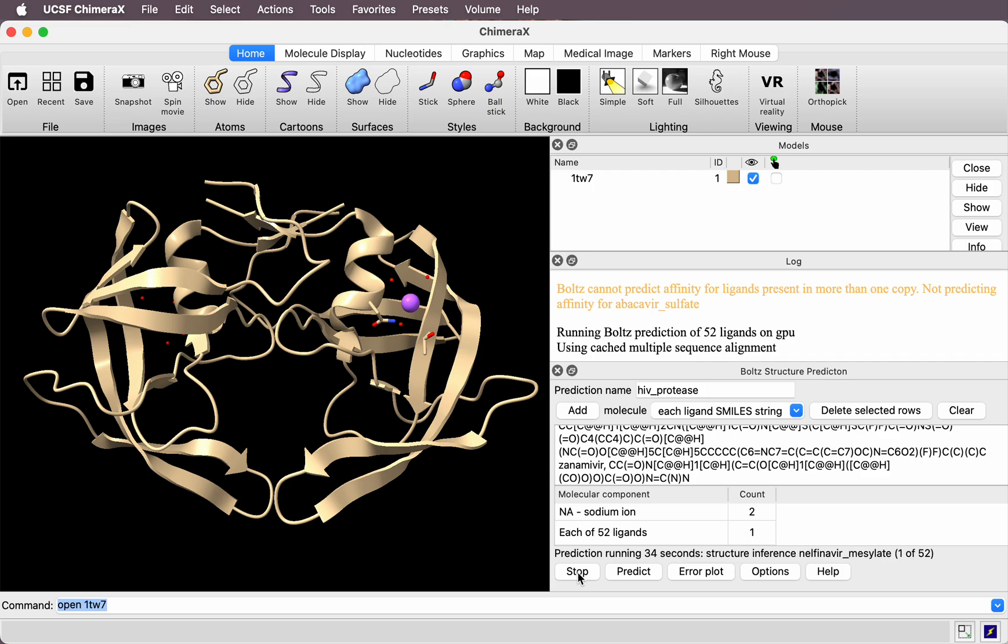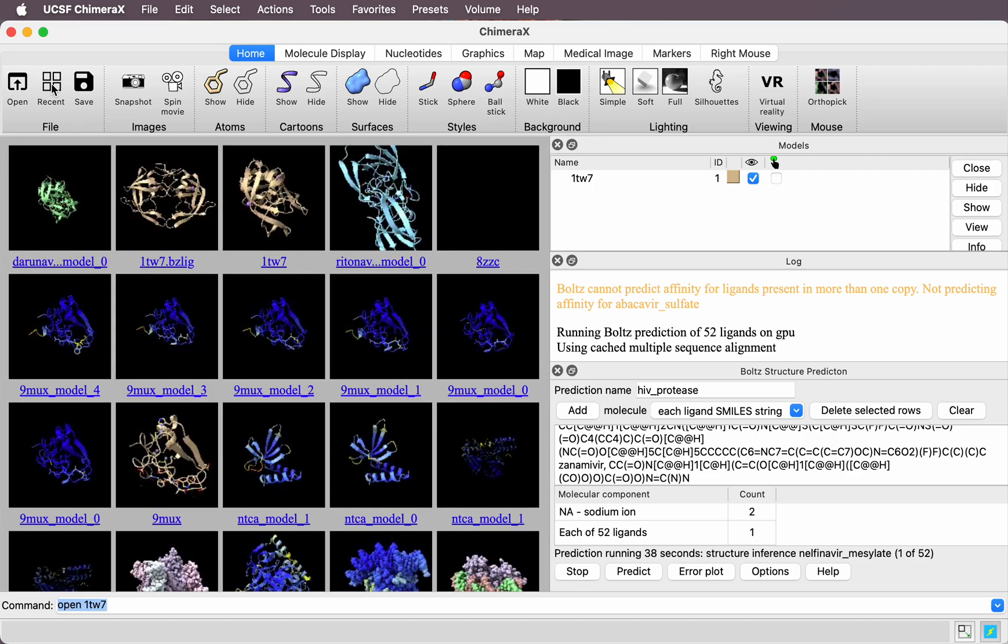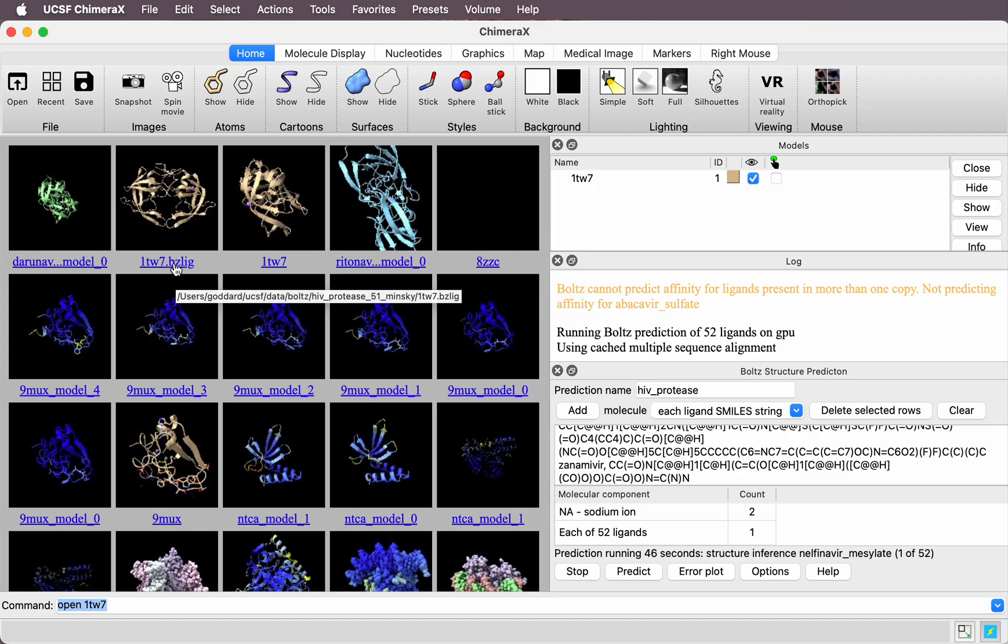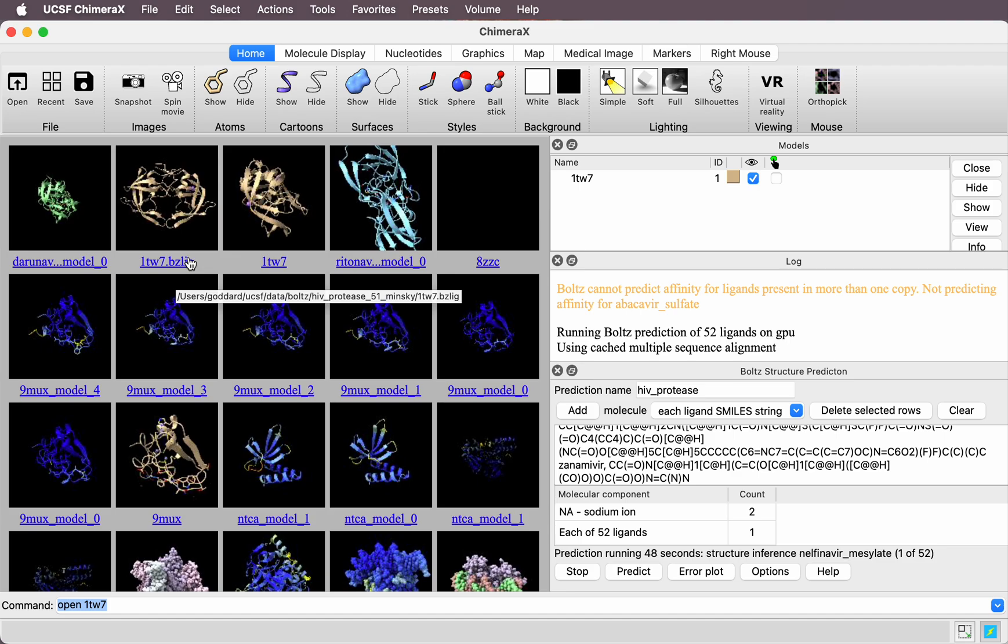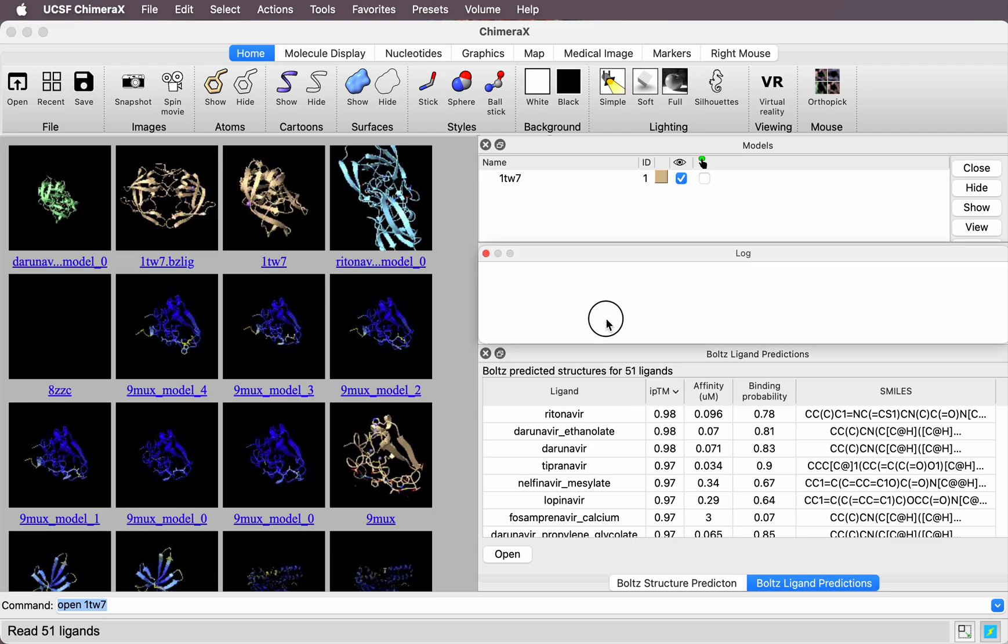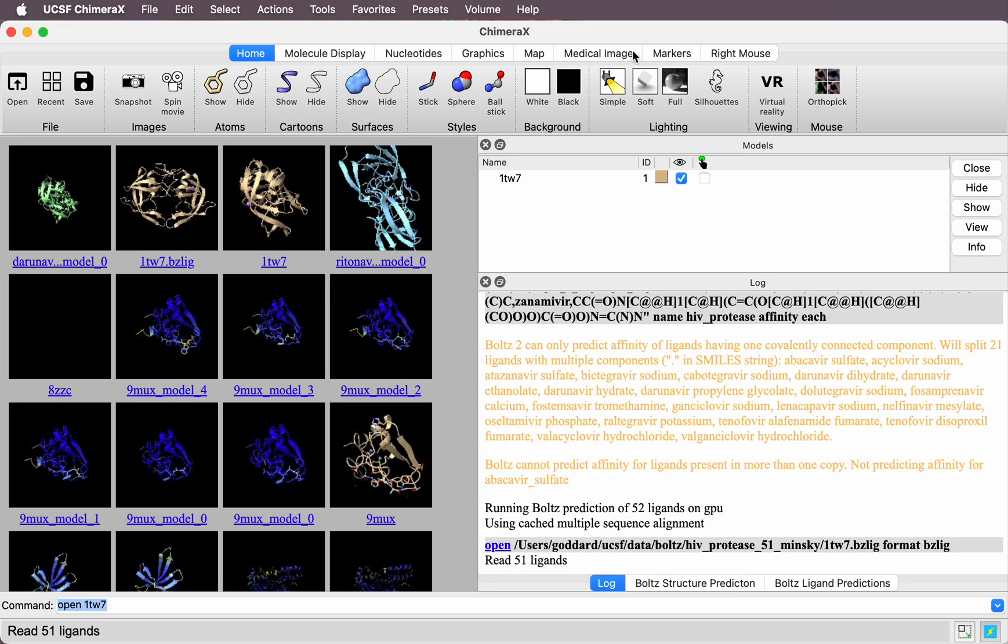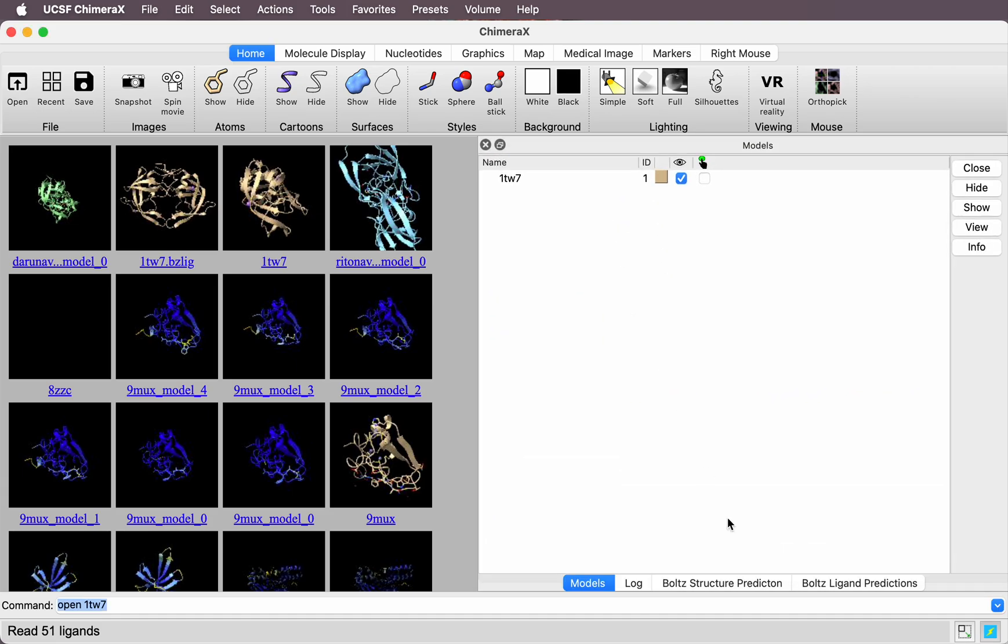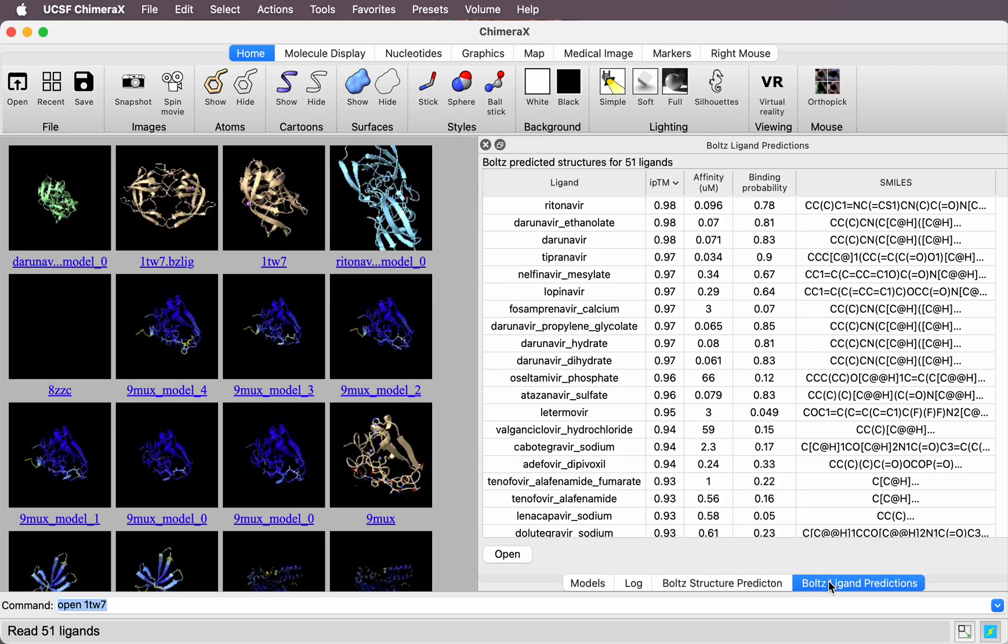When it finishes, it will show a table. Let me show you what that table will look like. It writes a comma-separated value file that's put in the history here. It's called 1tw7.bzlig. This is the table of results you would get after a couple hours.